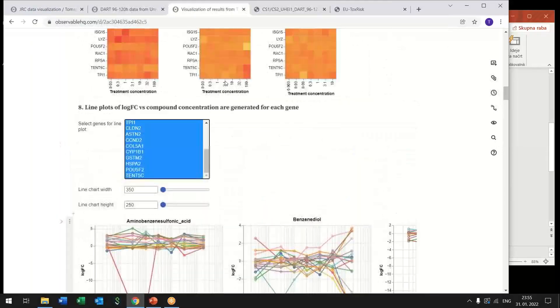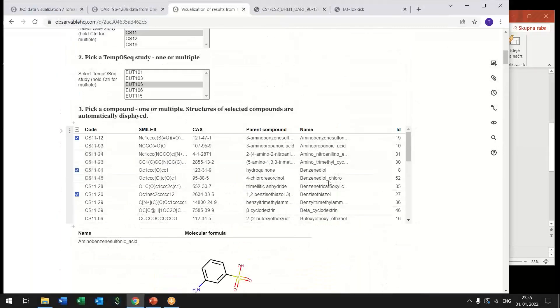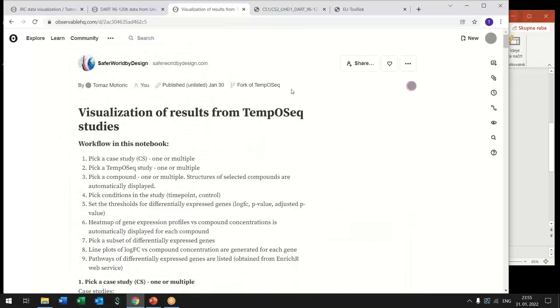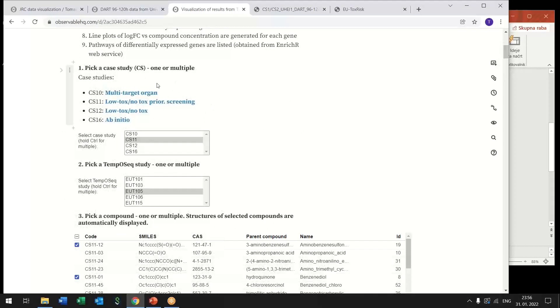The third example is this is the notebook that is dedicated for visualization of results coming from the TempoSeq studies. So this is genotoxicity assay. In this assay there are gene expression profiles that are measured.